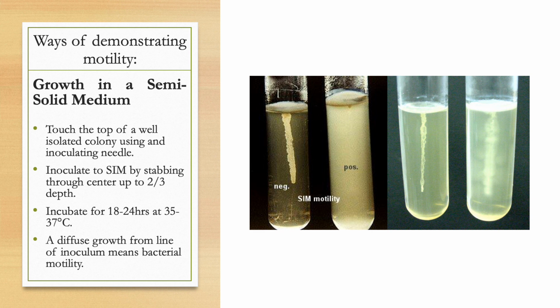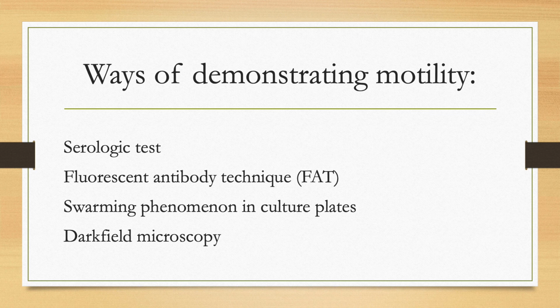All right, and don't forget that when we say semi-solid medium, these are usually agar with a concentration of 0.5% or less.